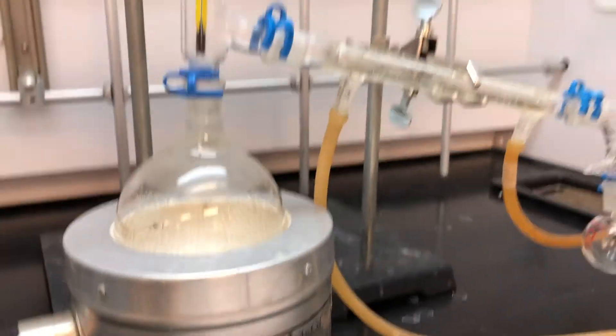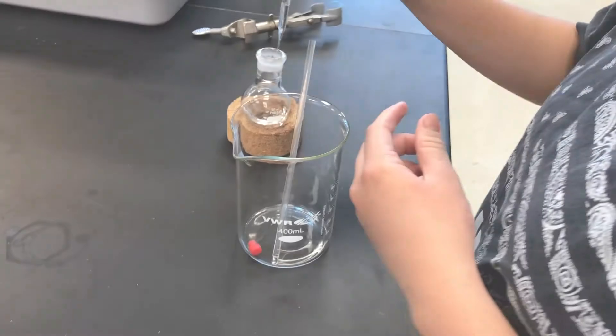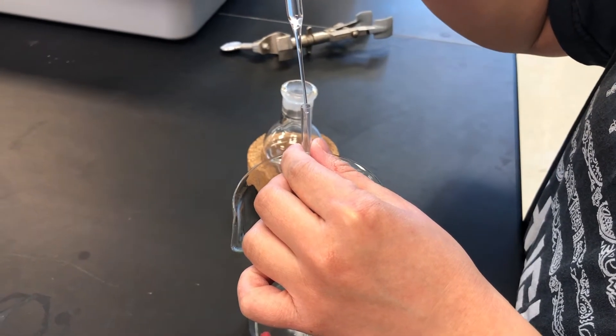After your distillation, mass out your tiny round bottom flask to find the mass of your isopentyl acetate. Carefully place the product into an HNMR tube and spin the tube multiple times.